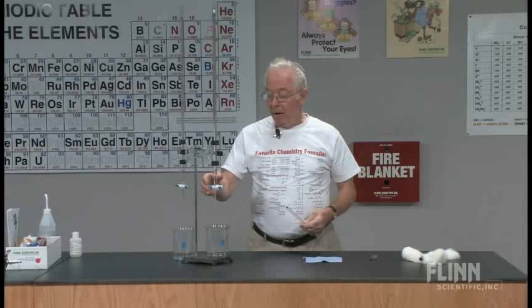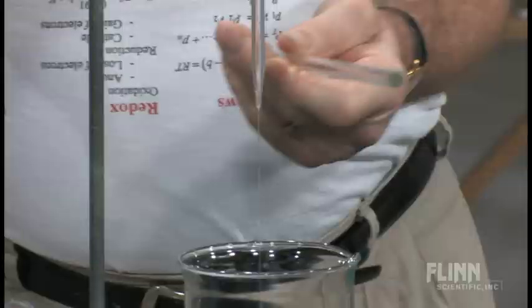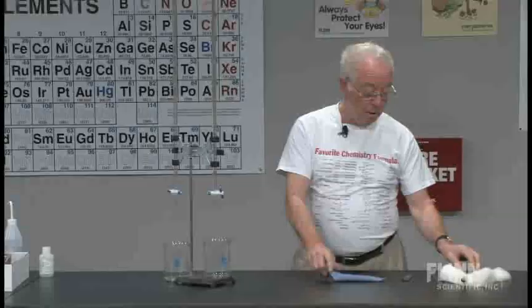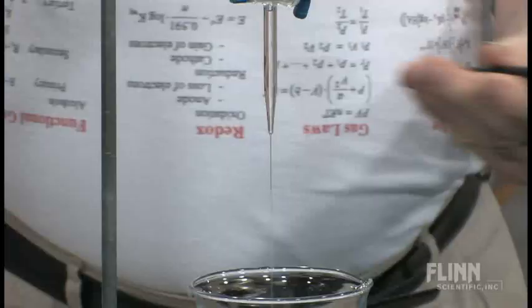Let's try the same thing with the other liquid we have here — toluene. With a glass rod, positive charge on the glass rod. Negative charge on the ebonite rod.